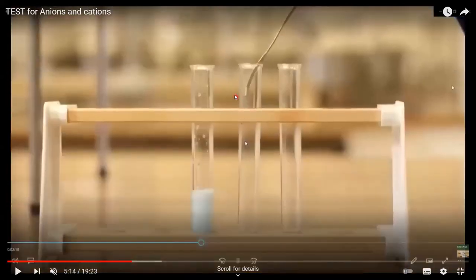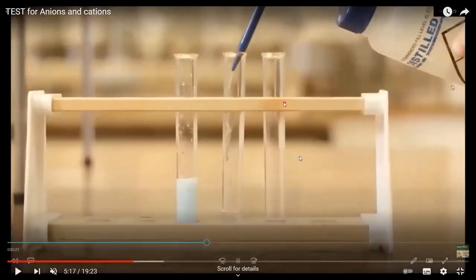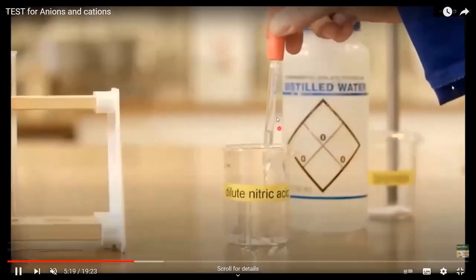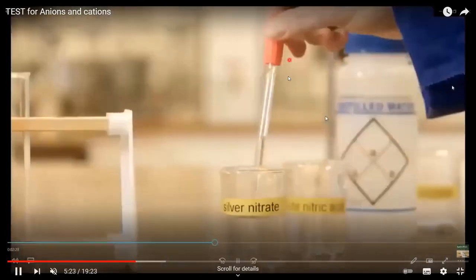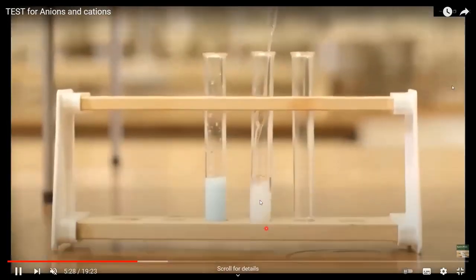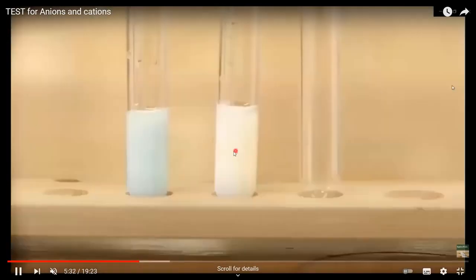Then we are again making a salt solution. We don't know which halide is there, maybe chloride, bromide or iodide. So first, using distilled water, we make a salt solution, then add nitric acid and then followed by silver nitrate. So when we add silver nitrate, what do you observe? You'll observe a cream color precipitate. So cream color precipitate means that bromide is there.